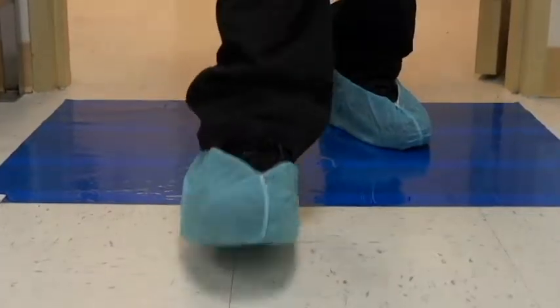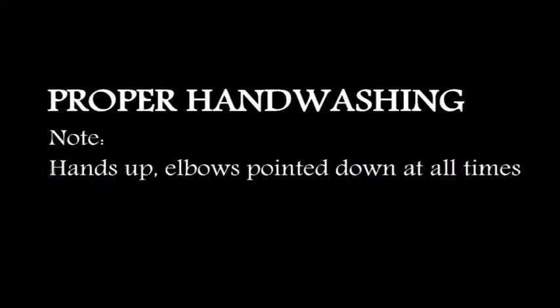Step off the sticky pad and proceed to the wash station. During hand washing, keep your hands up and elbows pointed down at all times.